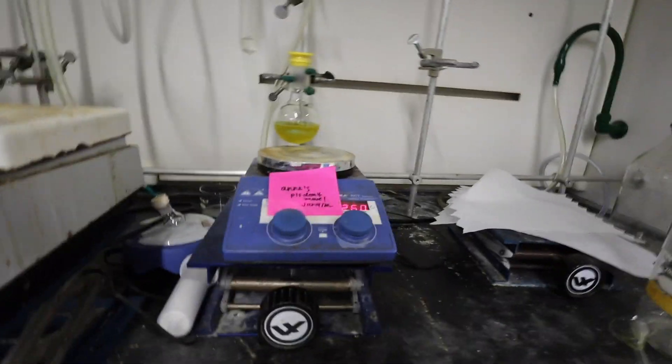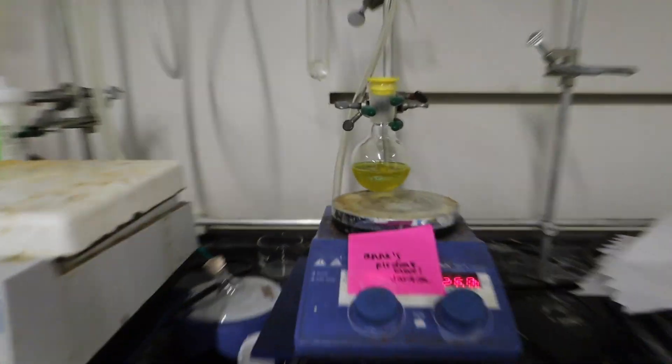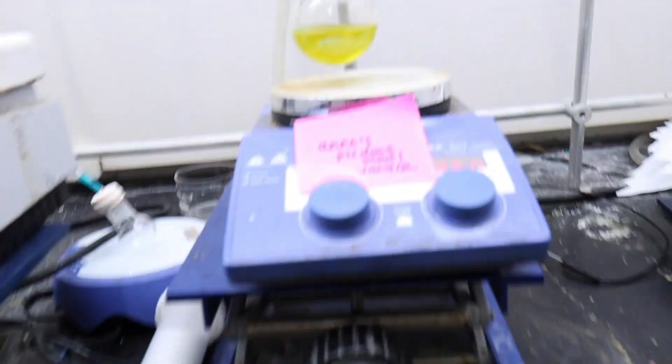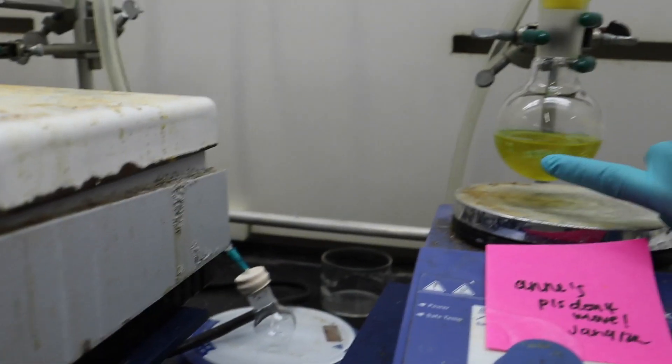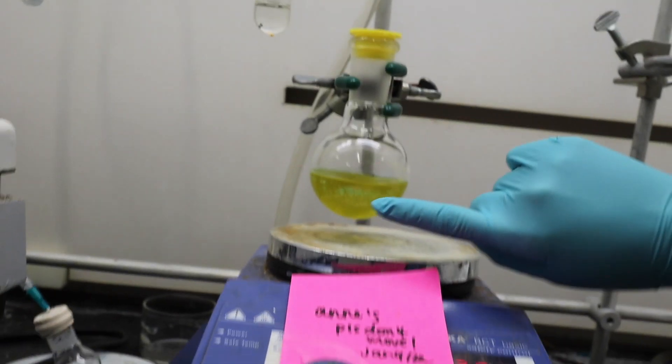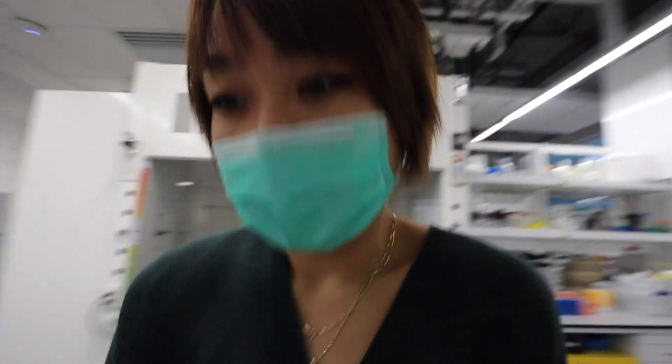Okay, this is my reaction from last time and as you can see there's some blue stuff here, so that means that the copper precipitated out, so the reaction should be done. Oh my god, I haven't done this in forever.